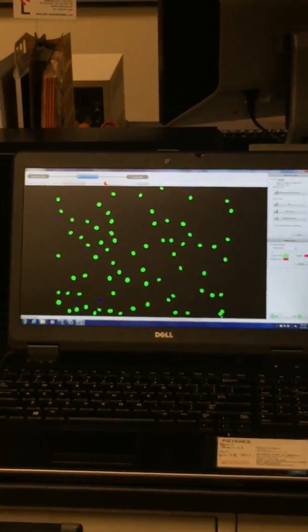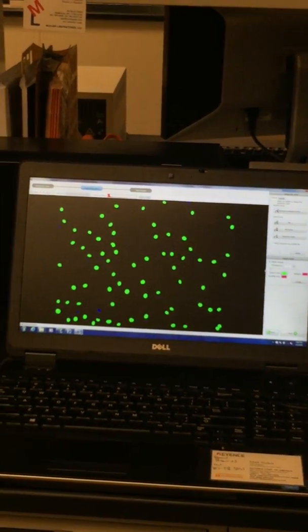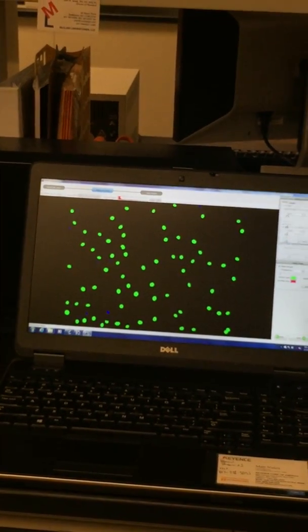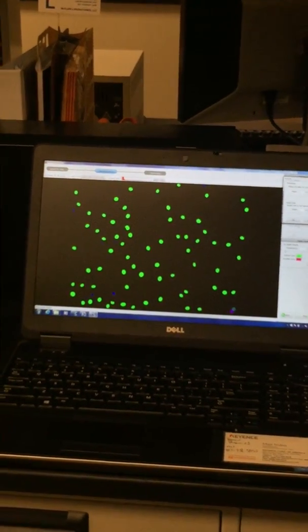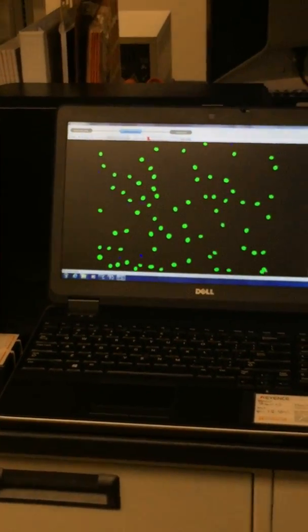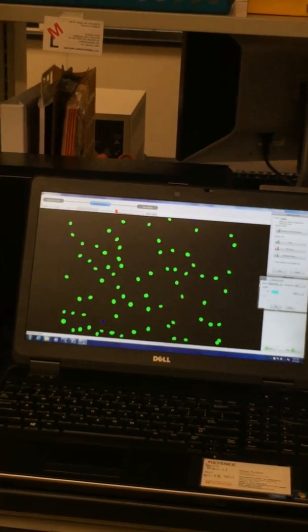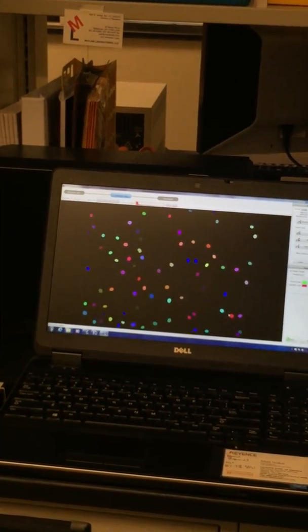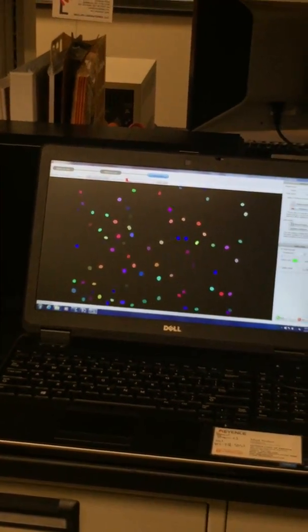These two little nuclei right here are obviously stuck together, probably because they're overexposed, but we can clearly tell that there's two there. If you just go to separate areas and bring this all the way up, it renders them two different colors so that you know they're going to give you the most accurate count possible. They go back to the same color, but if you go to details and go to random color, if that helps you visualize things better, then there you go. Go to next. 72 of them in here.